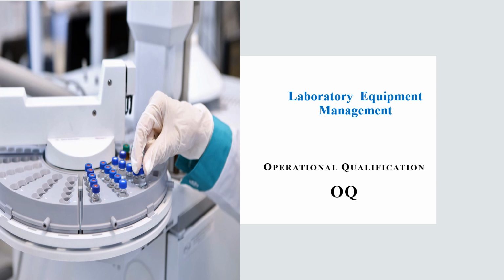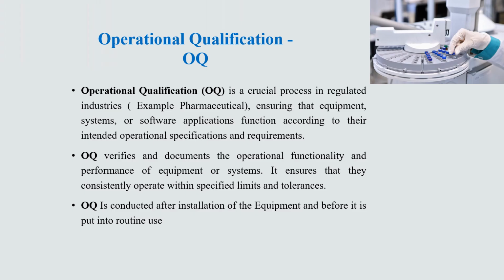Today's session will focus on operational qualification for laboratory equipment. Operational qualification, also known as OQ, is a crucial process in regulated industries, for example, in the pharmaceutical industry, and it ensures that equipment, systems, or software applications function according to their intended operational specifications and requirements.